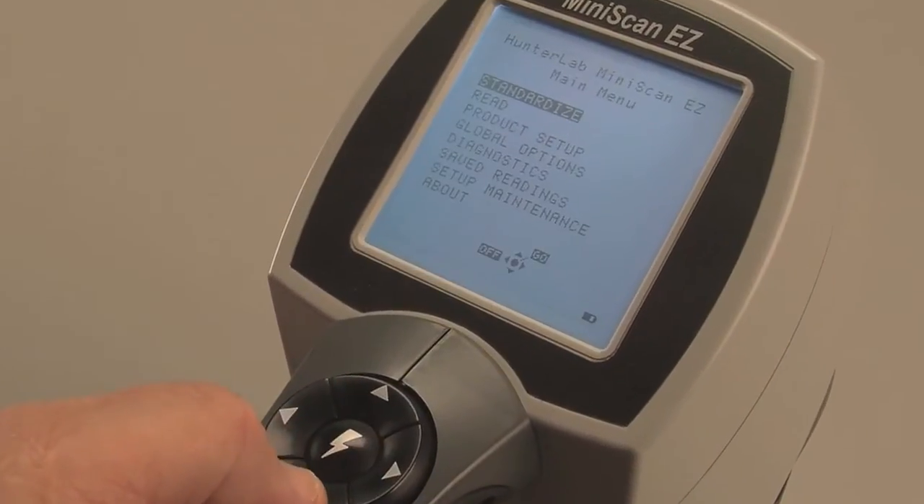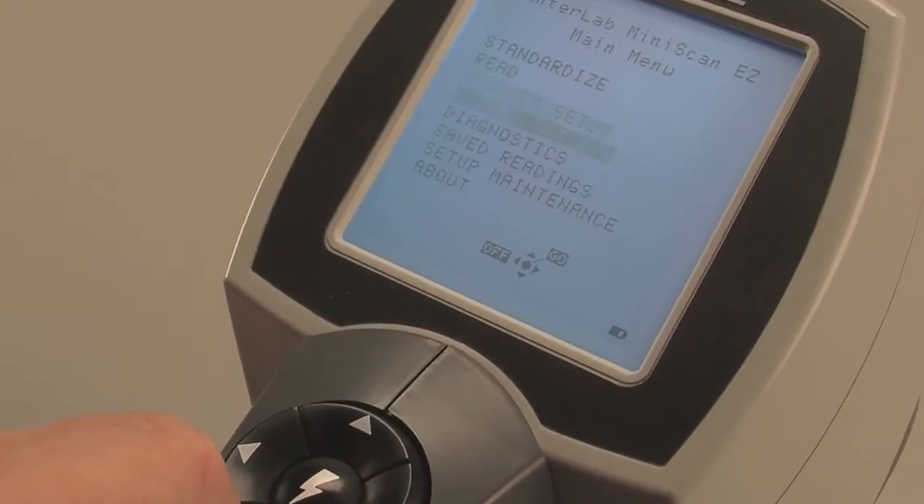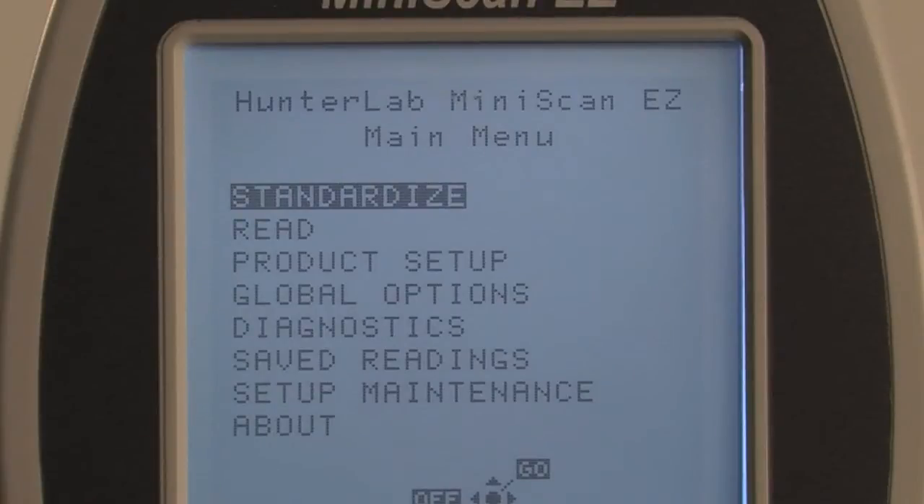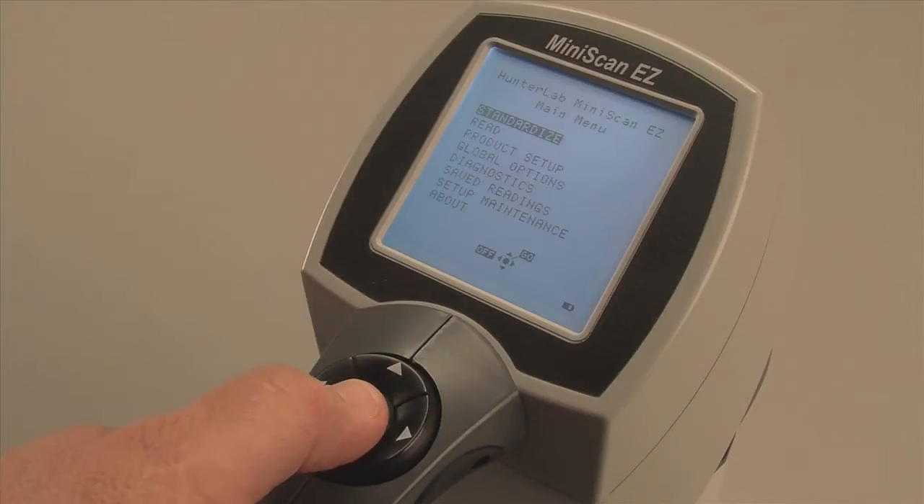Select Standardize from the Miniscan EZ's main menu display by using the cursor's up and down arrows. Once Standardize is highlighted, press the center Go button.